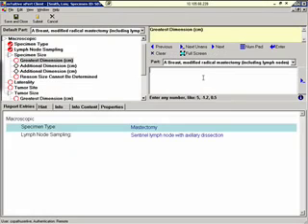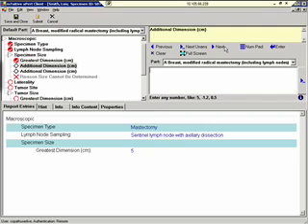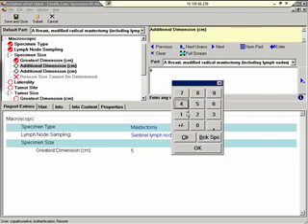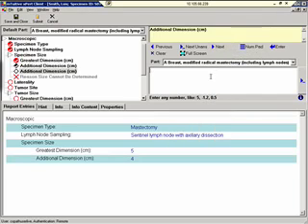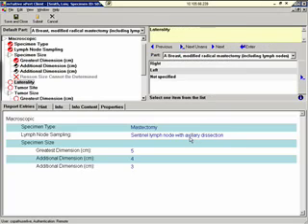Specimen size, greatest dimension, 5. Let's use the number pad to enter the additional dimension, 4. And the final additional dimension, 3. It's important to note that you can enter data using a keyboard and mouse, touchscreen, or a stylus if you're using a tablet PC. Laterality, left.